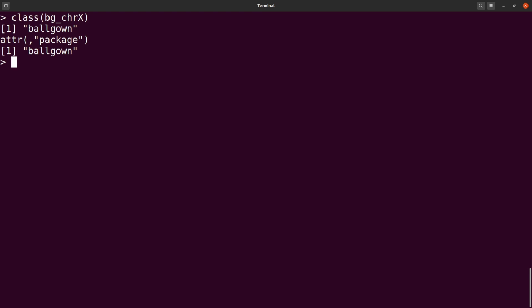The entire human transcriptome is huge, and so usually we use high-end servers or PCs to do the analysis. Downsampling and giving us just a portion of it is useful so that we can reproduce the entire tutorial and commands using our normal laptops. So that is why we have this there. It just tells us that we are using just the chromosome X data.